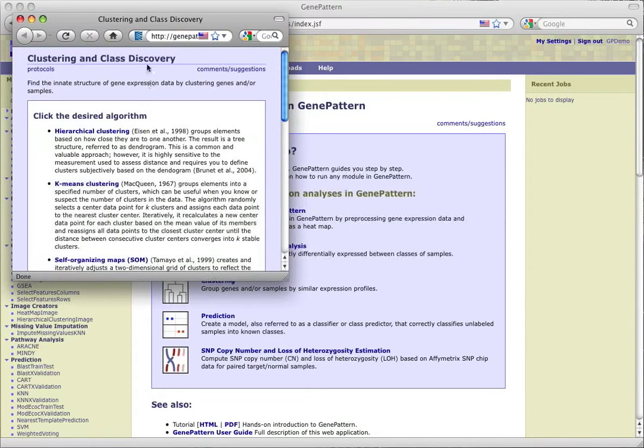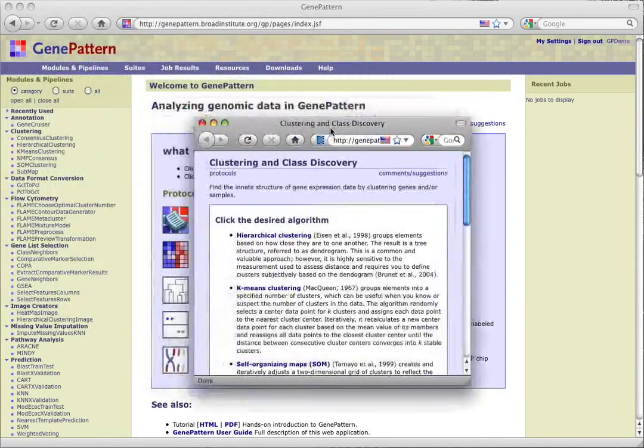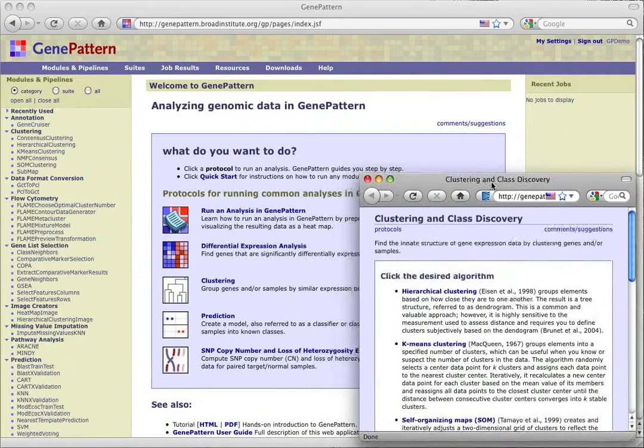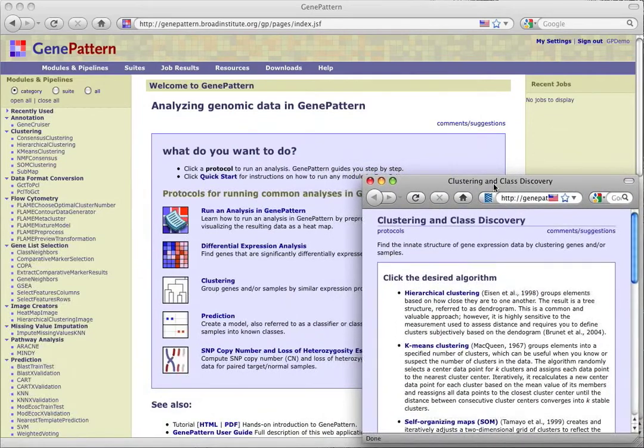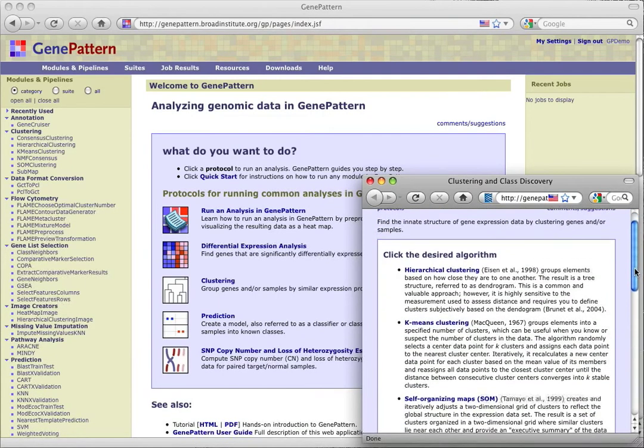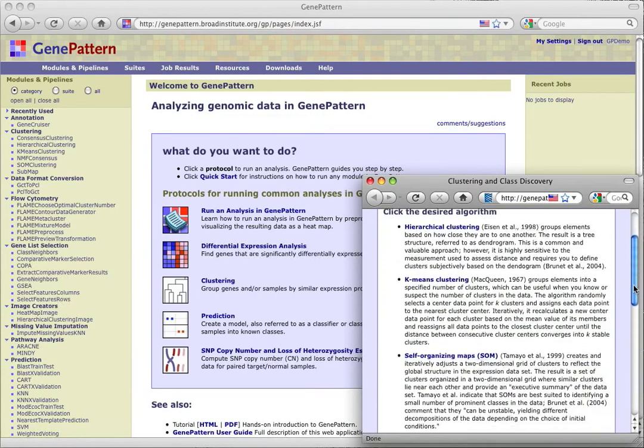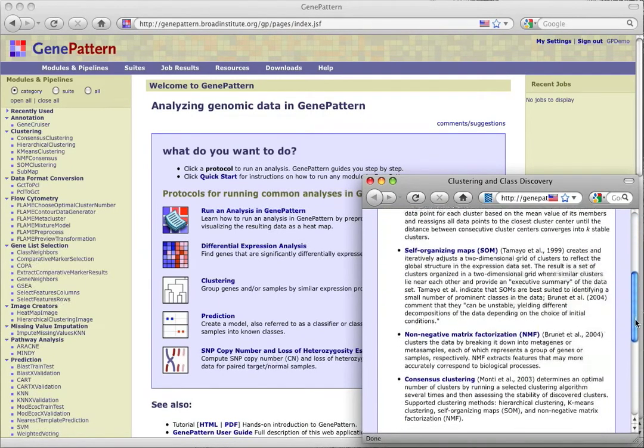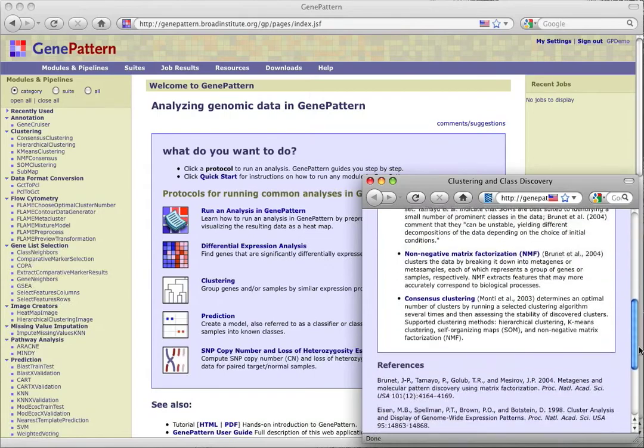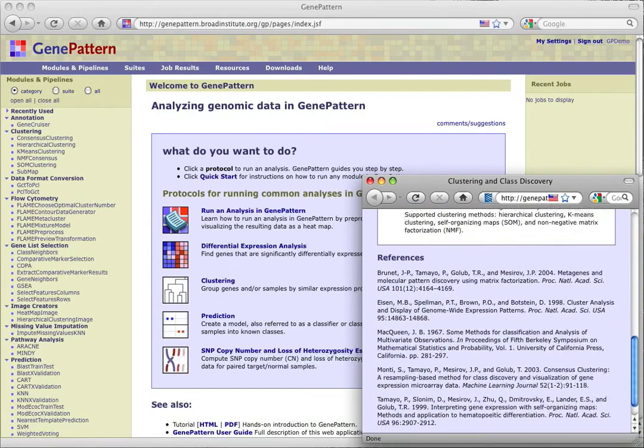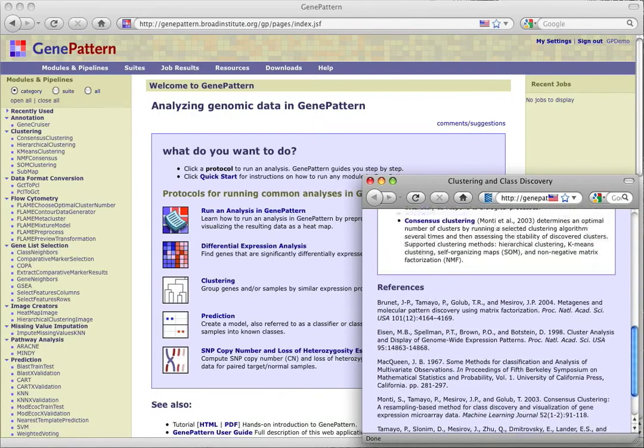This opens a small window displaying our chosen protocol. The offset window will allow us to place the window where we can see it as we start to configure our modules. The protocol first gives us a summary of its intent, then asks us to choose what kind of clustering we'd like to perform, and provides a description of each protocol. References for the algorithms are found at the bottom of the page.